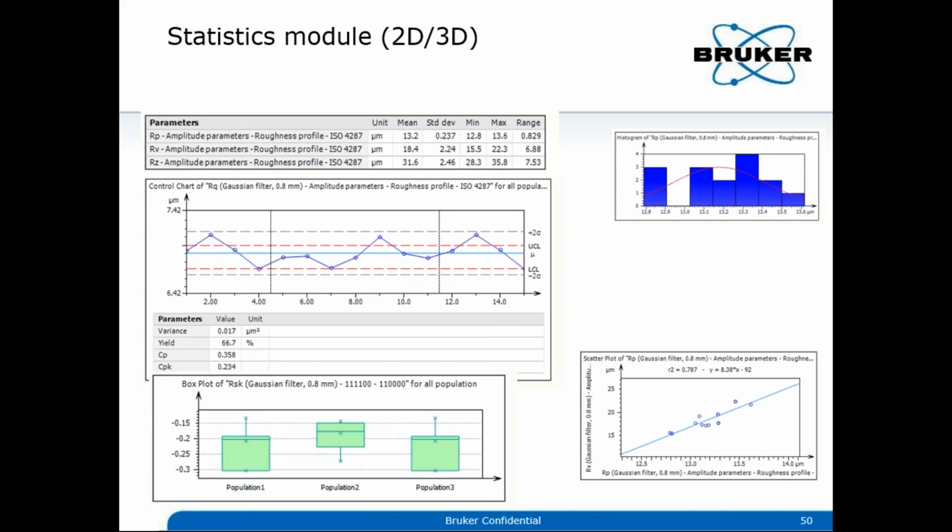So, for example, you have measured multiple locations. It will show you the upper limit, lower limit, and the mean line, and also do some correlations using the statistical data. So this will be a very good module for people in a process where you have a lot of data, and you can use this software to calculate the process-relevant parameters for you to control the process.